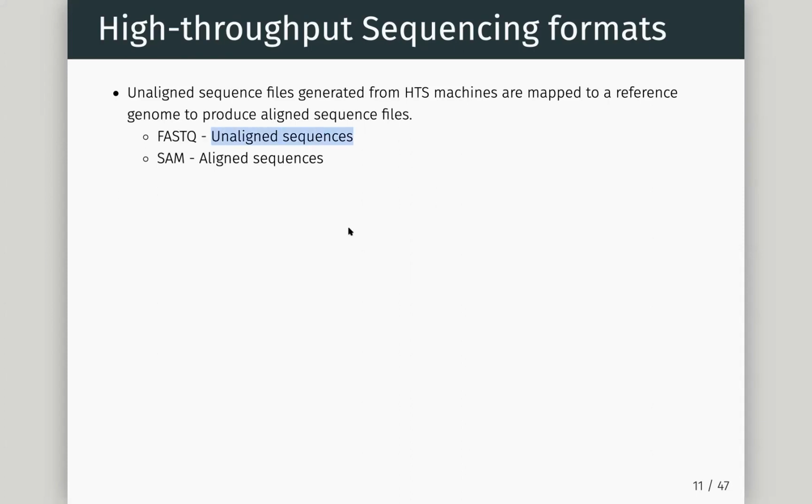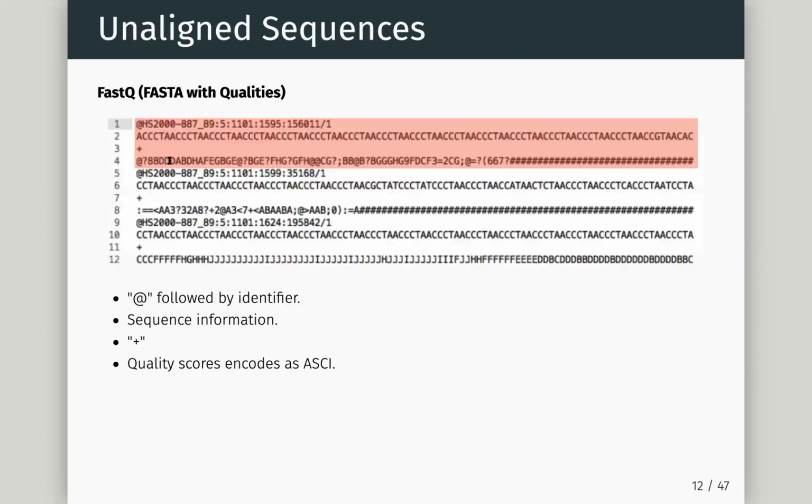That's our unaligned sequences. Our aligned sequences are usually, and again, this used to be more variable, but I would say 99.999% of the time, in something called SAM format. Especially modern aligners, modern tools, are going to produce this type of format, SAM or an equivalent binary version.